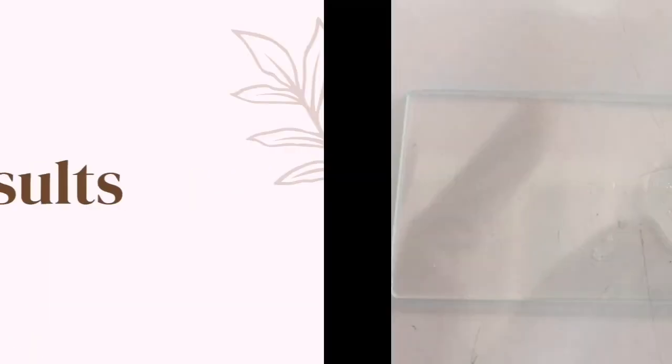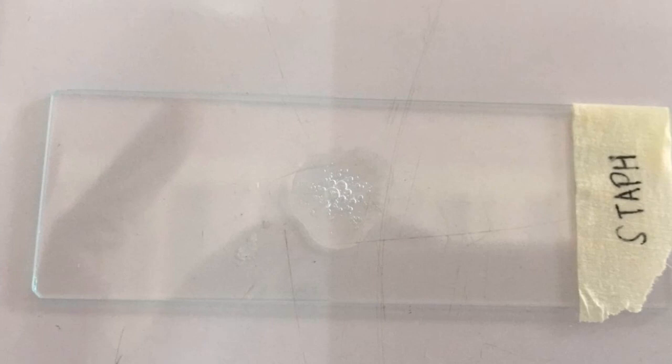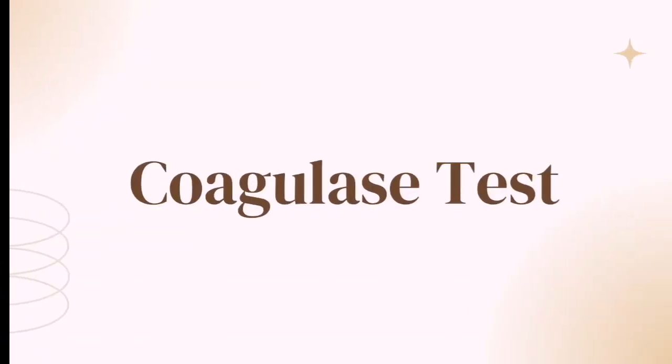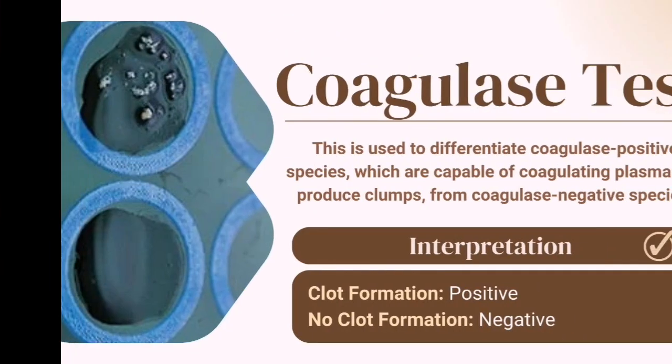Here are the results. For Staphylococcus, there is a formation of gas bubbles, which implies that it is positive for Catalase test. Whereas for Streptococcus, there is no presence of gas bubbles, which indicates that it is negative for Catalase test. Next is the Coagulase test.